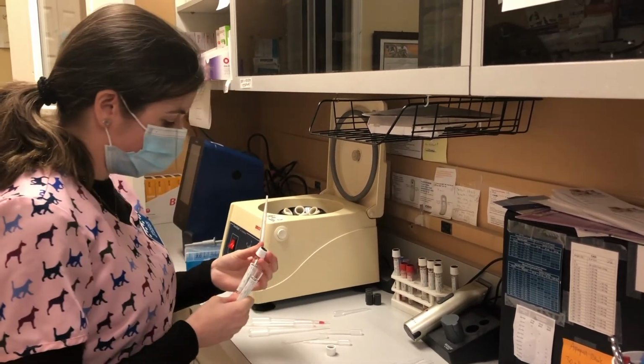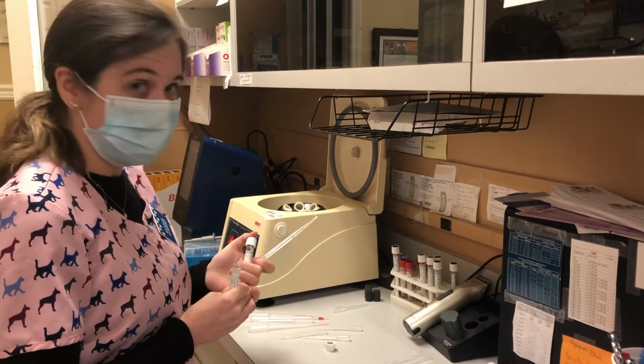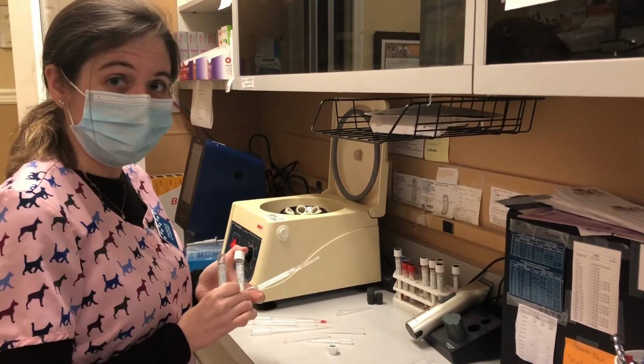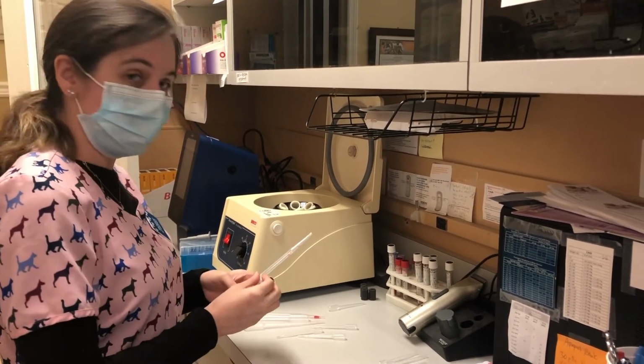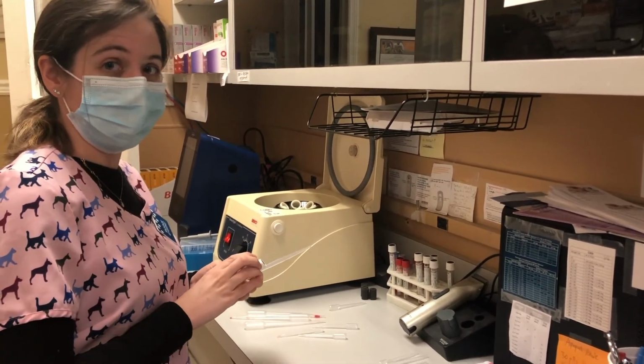So now that all of my tubes have been made, I'm going to let them sit for 30 minutes at room temperature, and then I'm going to centrifuge them for 1 minute at 3,400 RPM.